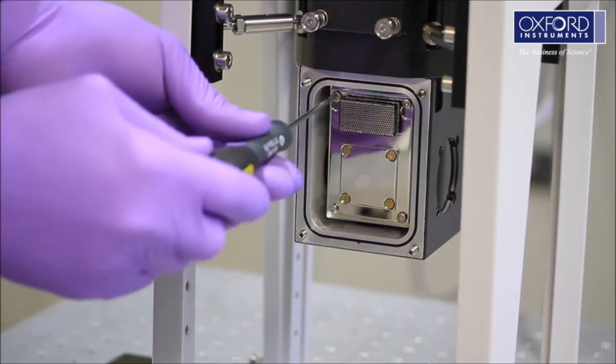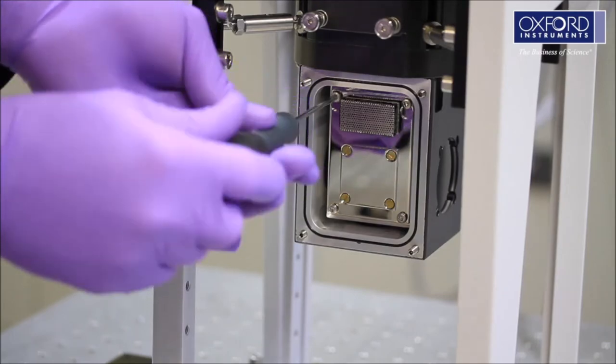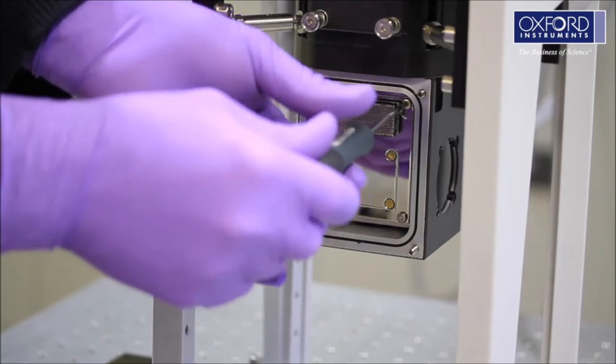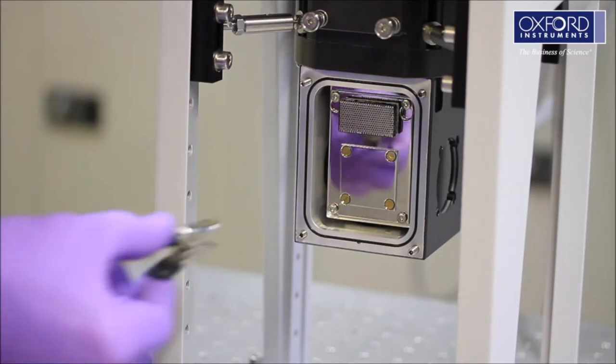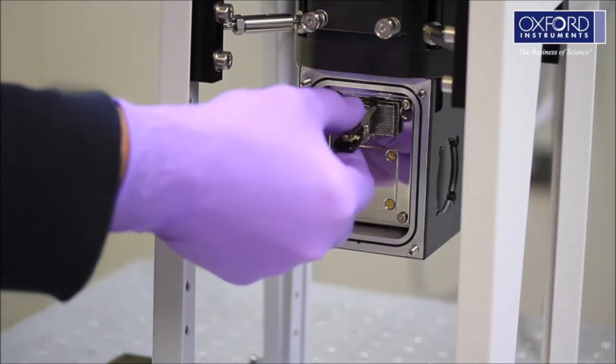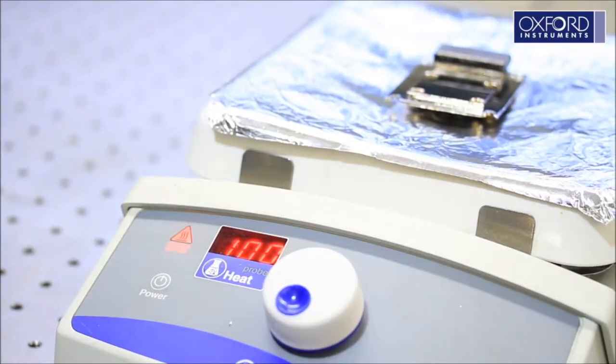Unscrew the four bolts holding the radiation shield plate by two or three turns, then remove the radiation shield plate. This plate contains the sorption pump which needs to be conditioned each time the sample space is accessed. Place it on the hot plate at 100 degrees Celsius until you are ready to refit it. It should be heated for a minimum of 10 minutes.